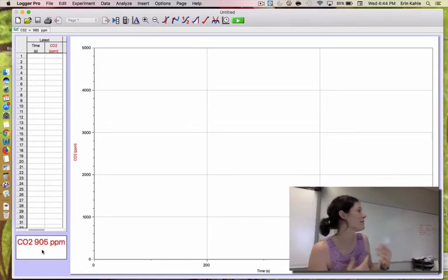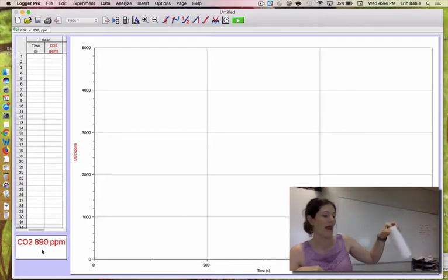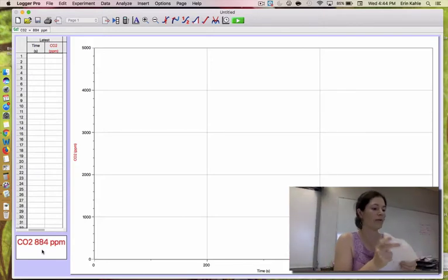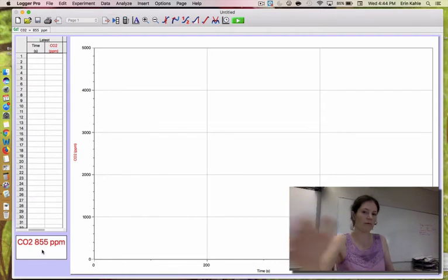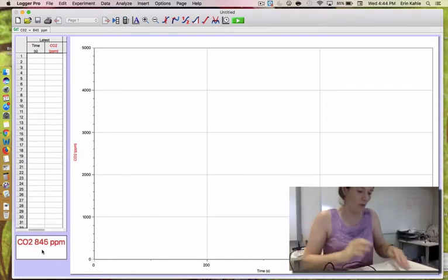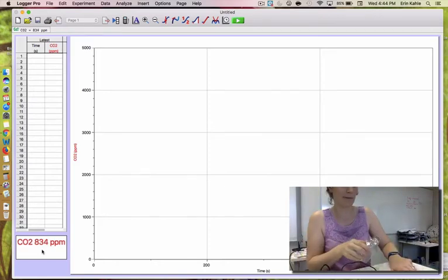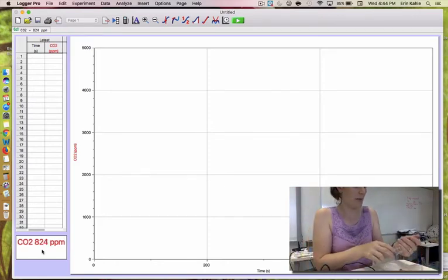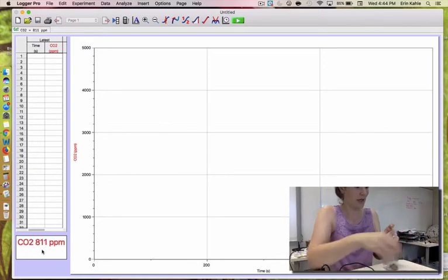So your beans, you're going to want to take them out so they're soaking, and you probably want to count out, I think like 30 beans would make sense. I'm just going to grab a handful here. You want to dry them off because you don't want a lot of liquid on the beans. Then you just dump them in this container.